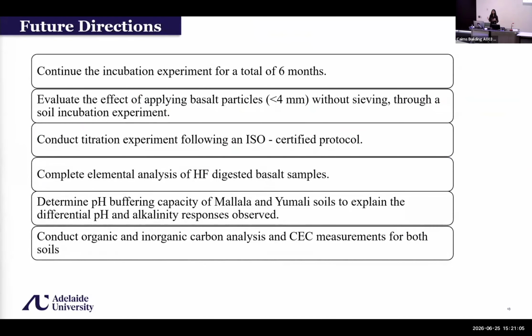At this moment I did the titration for 48 hours, and I was thinking of doing it for 72 hours or increasing the time, and to complete the elemental analysis of HF digested samples, and to determine the pH buffering capacity of both the soils to analyze more about the variations happening, and to conduct the organic and inorganic carbon analysis and CEC after 6 months of my incubation.